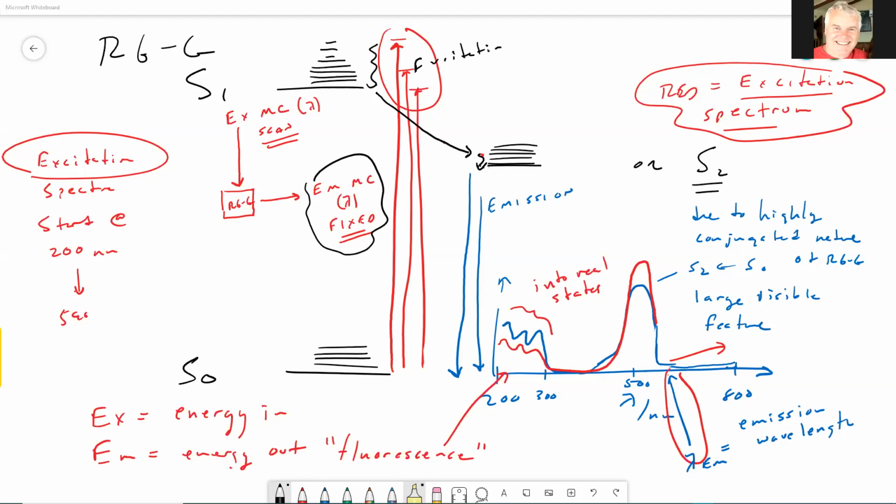Ah, that's really interesting. So Leo is saying that they're the same photons but lower intensity. And this brings about a really important distinction in spectroscopy.